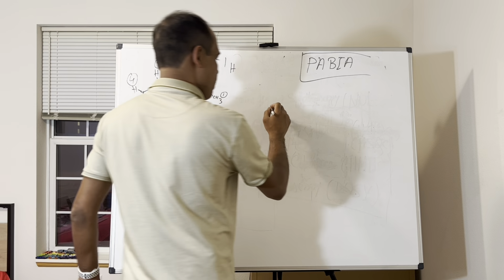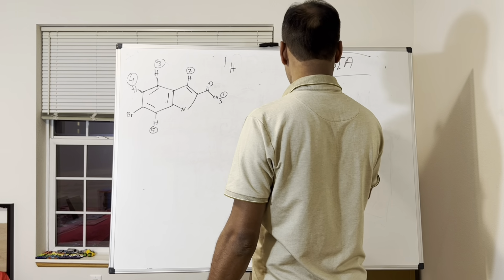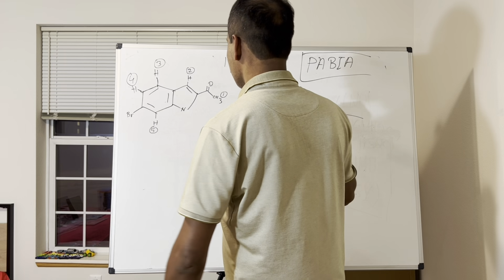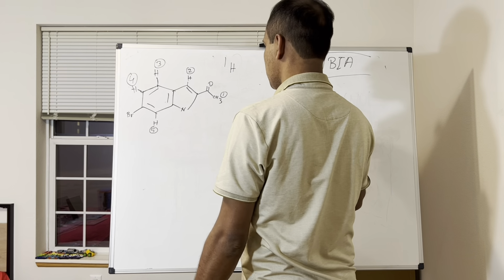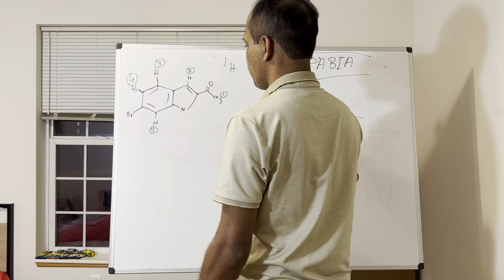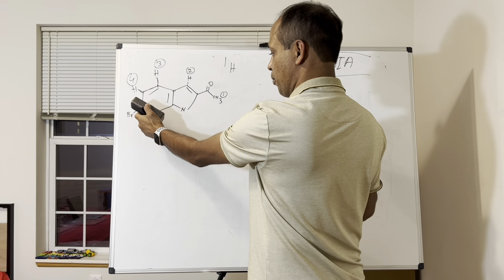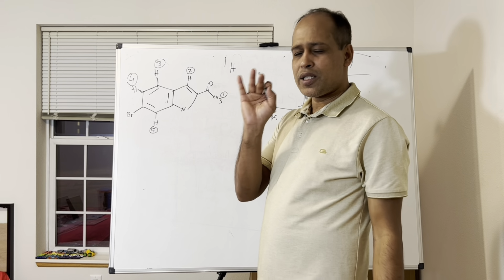So suppose that 3, like aromatic protons always show up around 7 to 8.5, okay? So 3 will see 4, so it will give you a doublet. So suppose this, and 4 will see 3, it will give you a doublet, but it also has another proton next to it, in between the bromine, so very shortly it will give you a meta coupling, a small quantity.